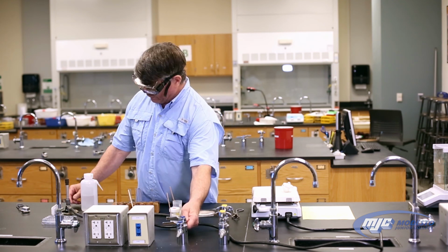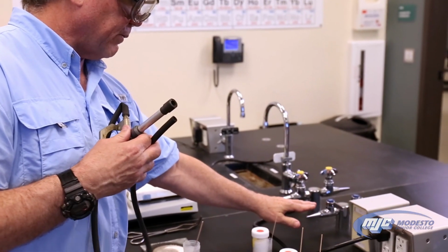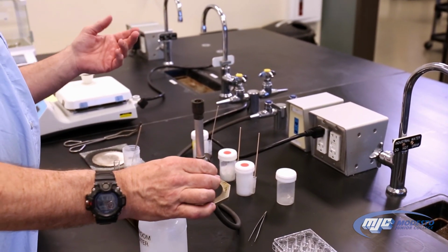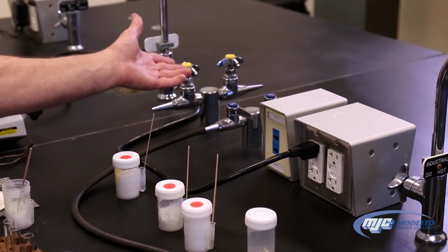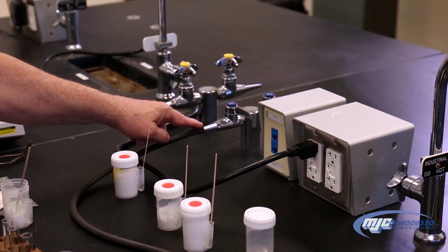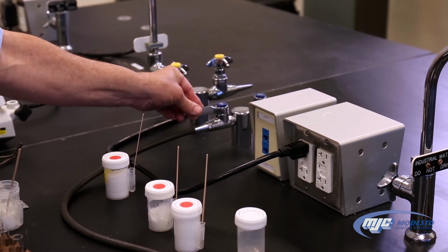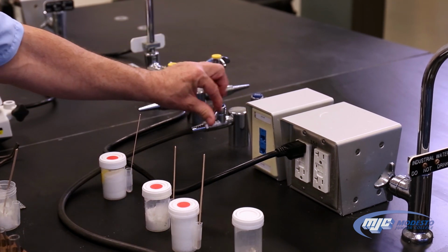So the Bunsen burner comes with a hose that attaches to a gas outlet here, and a Bunsen burner basically has 3 controls. The first control is the handle to the Bunsen burner. It's either on or off, and that's it. If this handle is perpendicular to this nozzle, either way, it's off. If this handle is parallel to this nozzle, it's on. That's it. We don't try to control the flow with that.